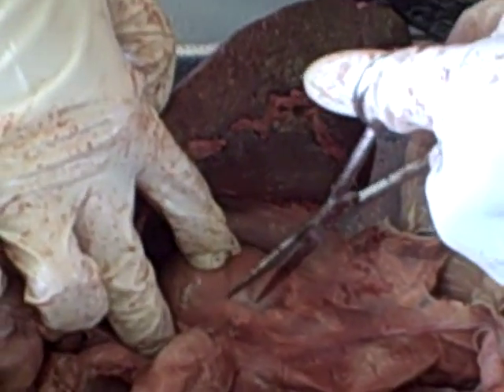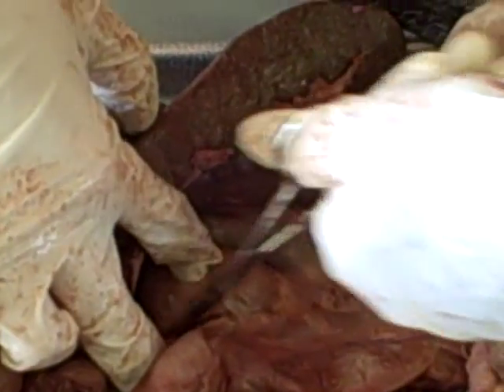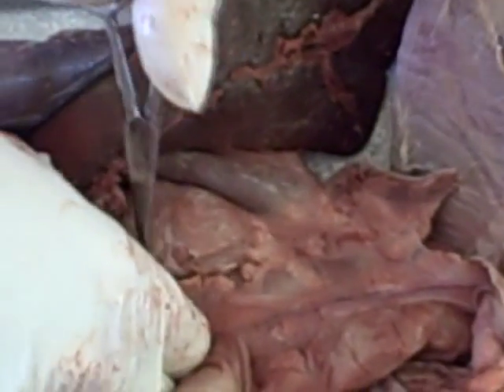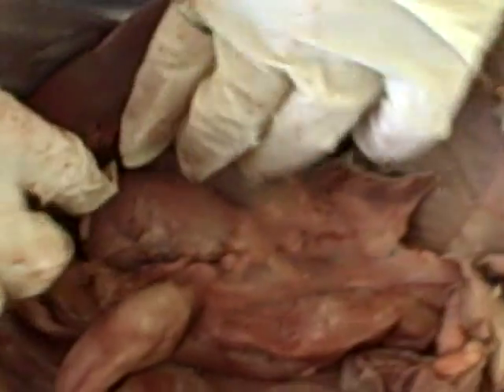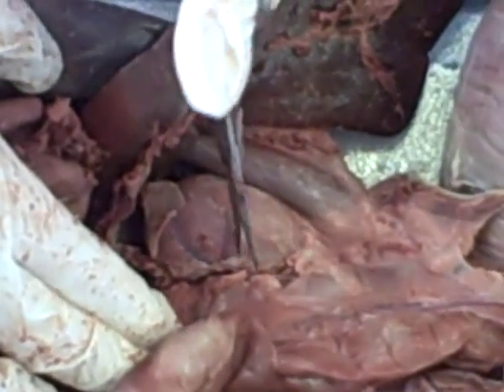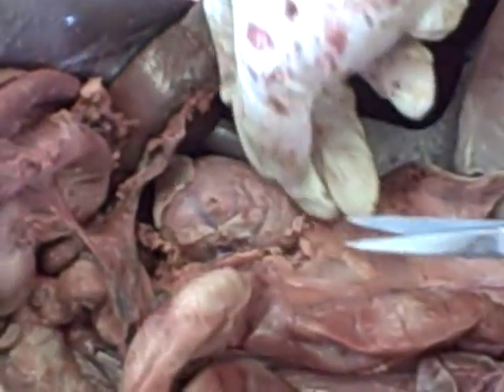Part of the excretory system: if you move the organs to the side, you can see a very firm-bodied organ, and you remove some more of the serous tissue that covers organs and separates them so they don't endure too much friction as they move around. I'm trying to get that off. There we go. You can see this large, firm organ. There's a pair of them. The other one is on the other side of the spine, lateral to the spine.